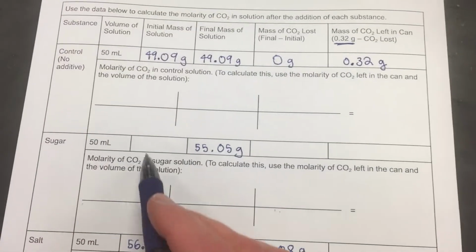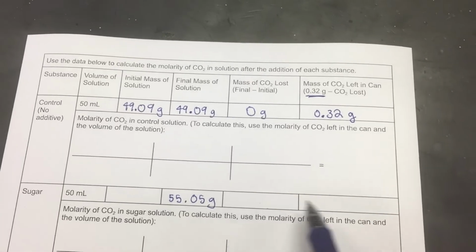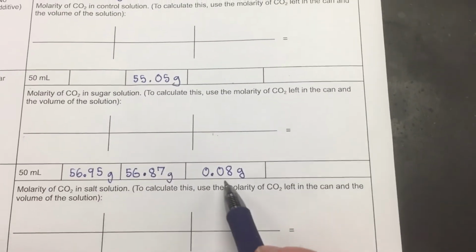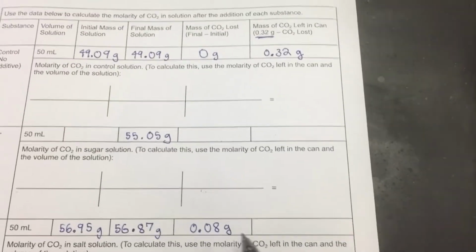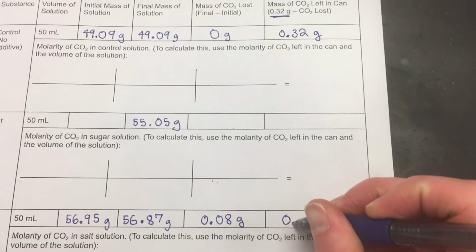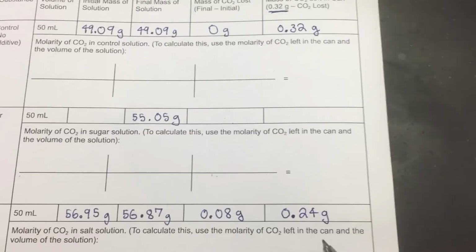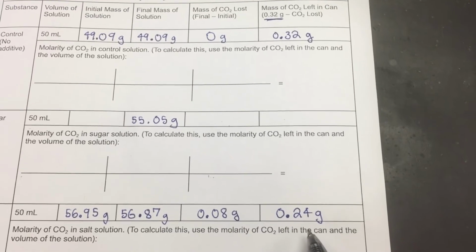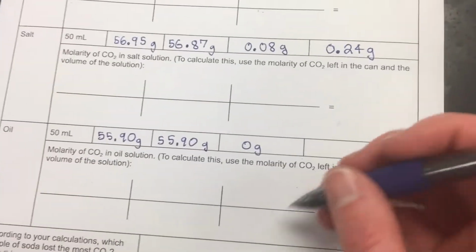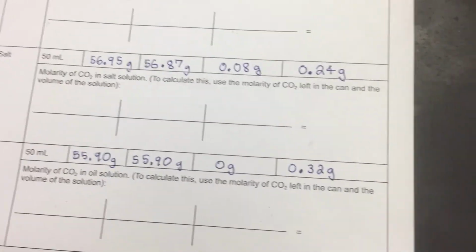For the sugar, you'll have to subtract those two numbers, and then subtract this number from 0.32. This one lost about 0.08, so 0.32 minus 0.08 would be 0.24 grams. That's the amount of CO2 left in the salt beaker. And the oil didn't lose any CO2, so there's still about 0.32 grams left.